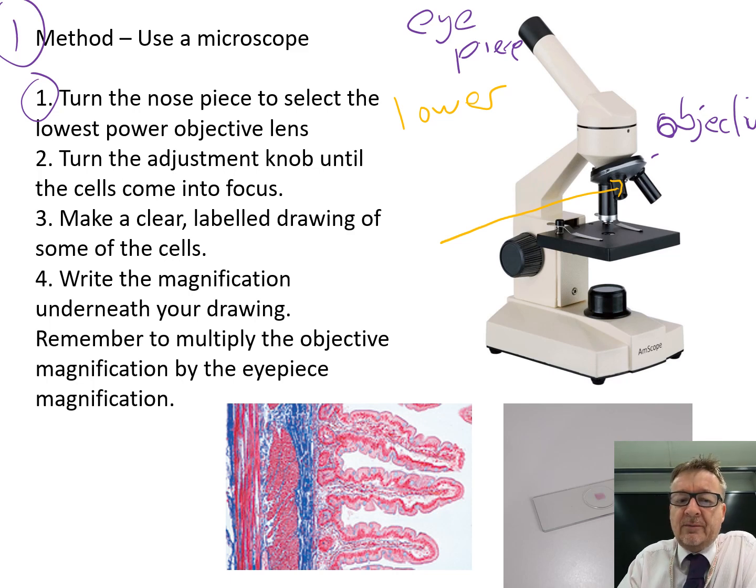Once it's on the lowest lens, turn the coarse adjustment knob until it comes into focus. Then use the fine adjustment dial to get it absolutely focused.